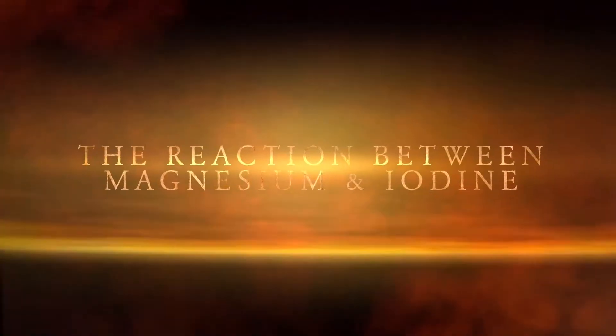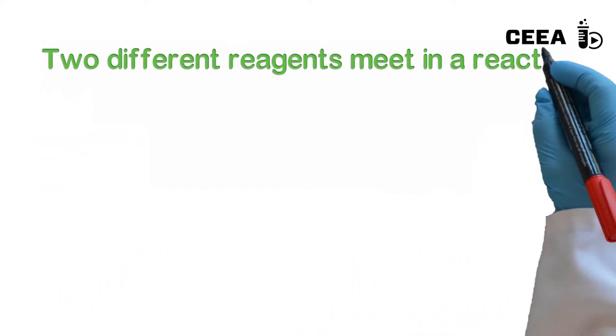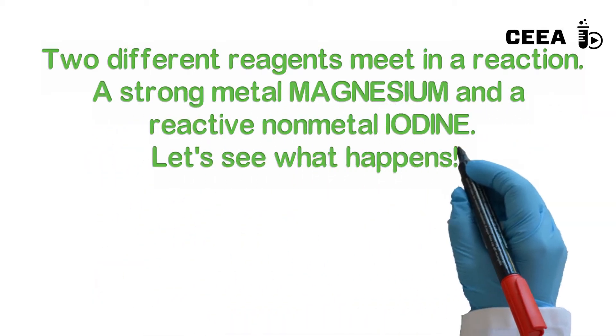Experiment number 51, the reaction between magnesium and iodine. This is a variation of experiment number 50, using magnesium as metal and reacting it with iodine.